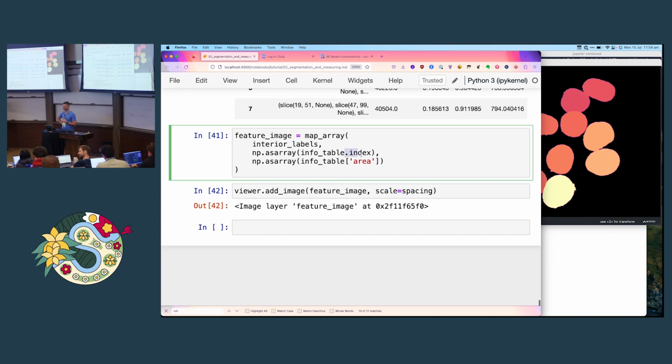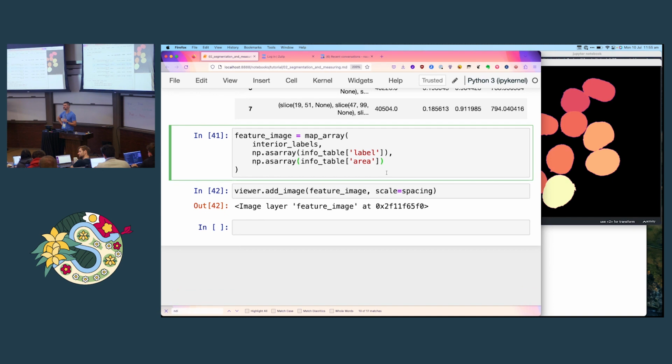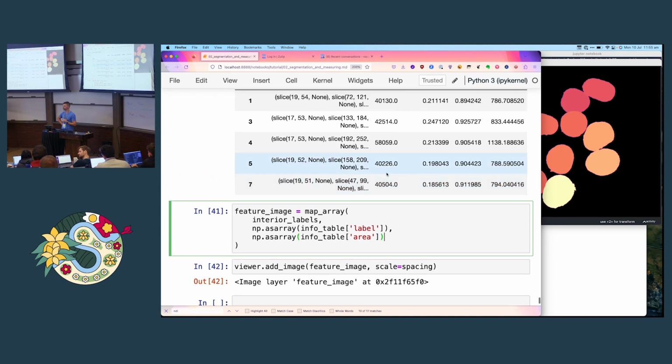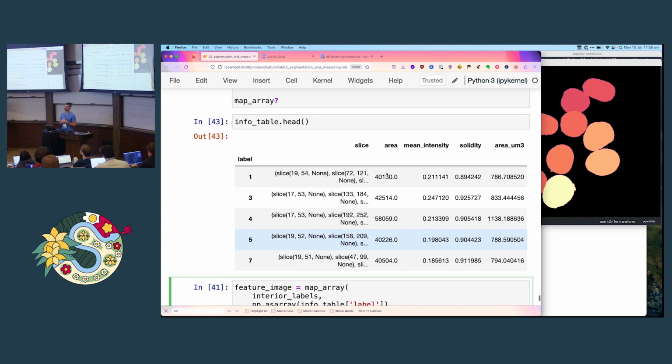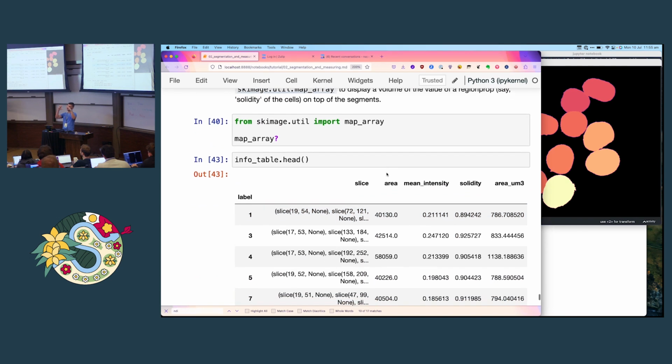When you showed this interactive demo, erasing the boundary between the two cells, I tried to replicate it, and at the end, my labels are smaller because I erased. But I think you fill at the end. No, I didn't fill it. You could refill it, right? You could take now the two labels and reapply.